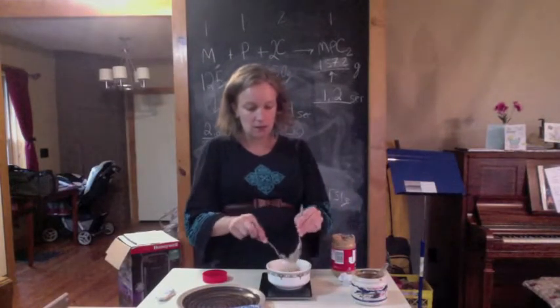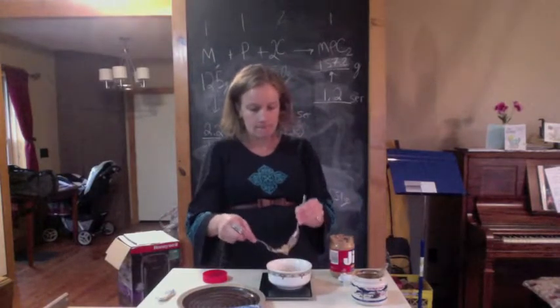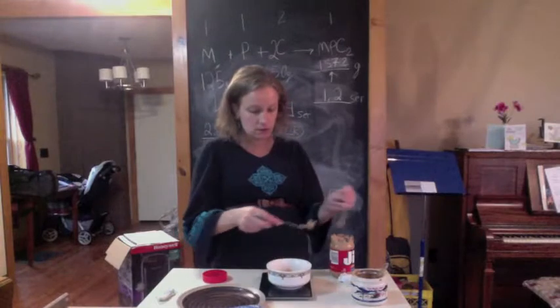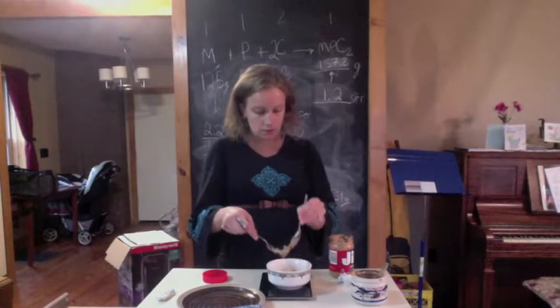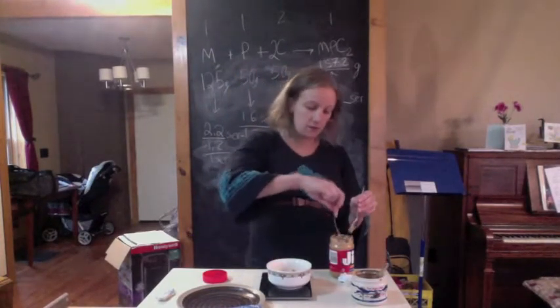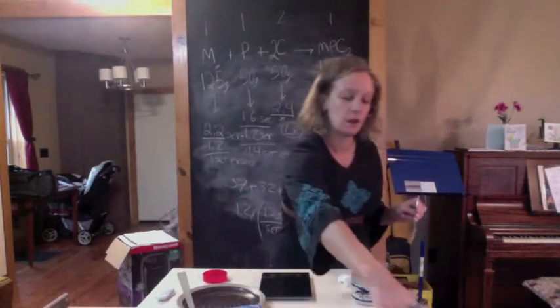So I'm still at 60 grams and I'm taking away, 55 grams, 54, 51, 50 grams. Okay, so now we have 50 grams of peanut butter. And I'll set that aside.